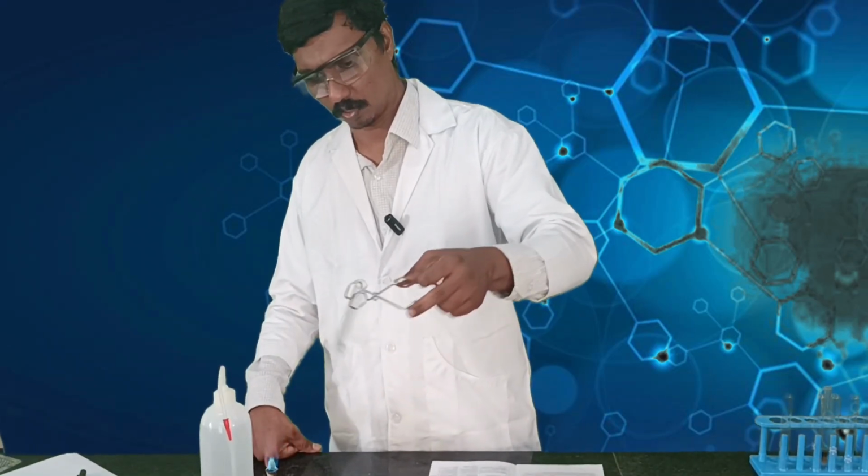The next test is the litmus test, where you take your compound, dissolve it in water, and then use the litmus paper to see whether it is an acid or a base. The organic compound that I have taken here does not dissolve in water, so I just warm it slightly so that to an extent it dissolves the organic compound.